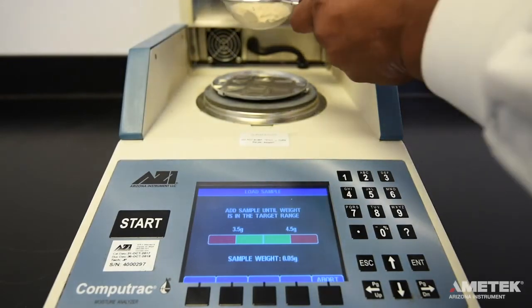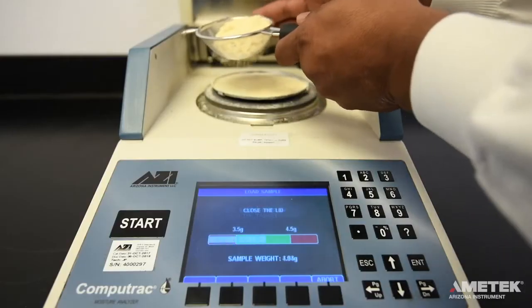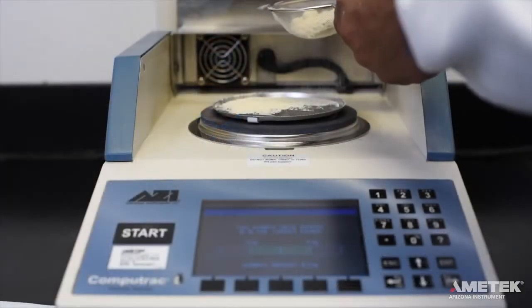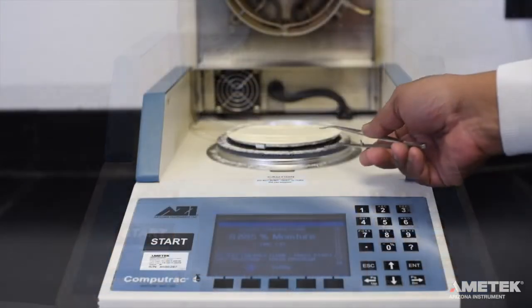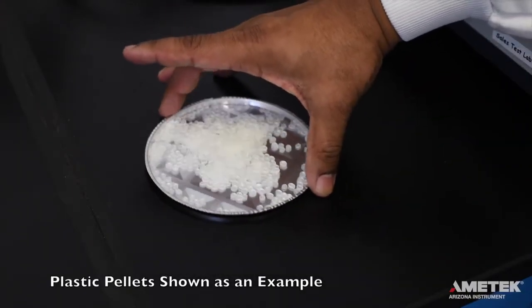Load the program sample size onto the pan. The screen will show a bar graph that is green in the middle and red on the sides. Any amount of sample that falls within the green area of the weight range graph is acceptable, but ideally you want to be near the center of the range to increase your test-to-test repeatability. The instrument can also provide an audible signal once your sample size falls within the green area. Once the instrument has registered the proper amount of your sample and before you close the lid, you can spread the sample more evenly on the pan if necessary. You can do this by lifting the pan carefully off of the pan support and placing it on a flat surface.